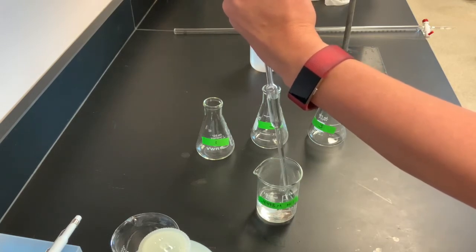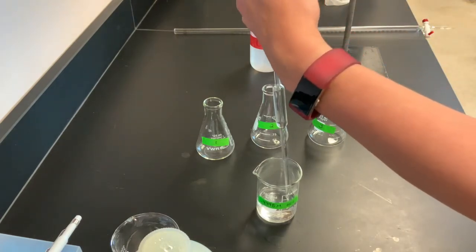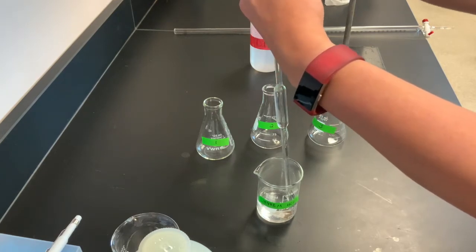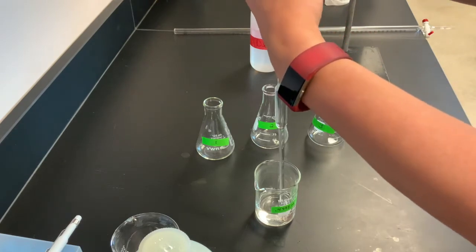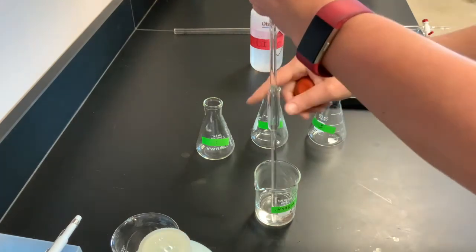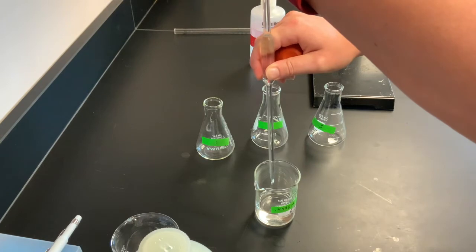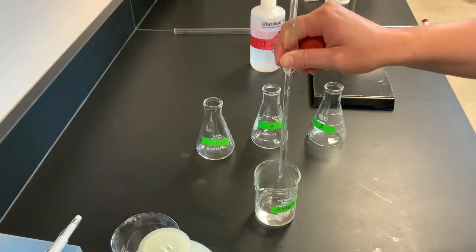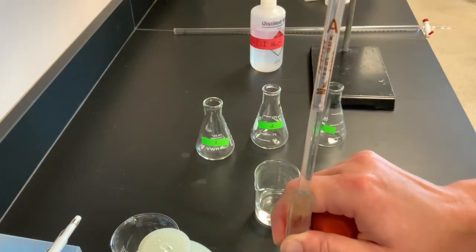We want to do this slowly. We want to get our liquid to our fill line, which is right in here. So what we want to do is get it just above that fill line. We're going to push the top off. Oops. So it went down a little bit. That's okay. We're going to pull some more back in, push it off, and then we're just going to slowly release our pressure until it's level with our fill line. So we're at our fill line now. See, the liquid is level.